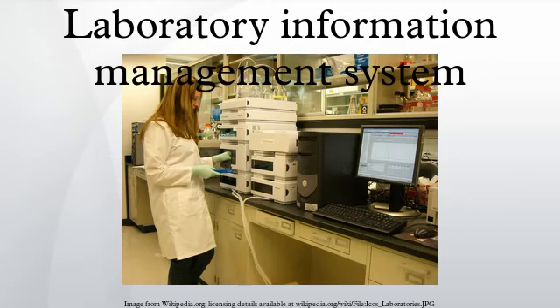In recent times, LIMS functionality has spread even farther beyond its original purpose of sample management. Assay data management, data mining, data analysis, and electronic laboratory notebook integration are all features that have been added to many LIMS, enabling the realization of translational medicine completely within a single software solution.